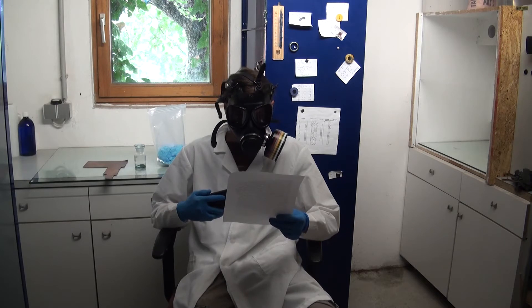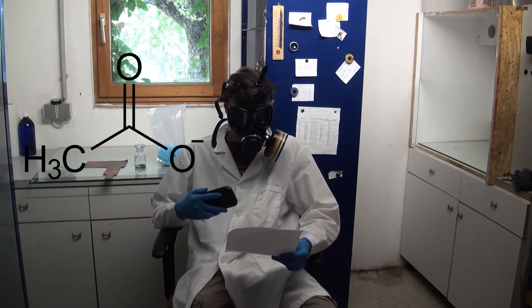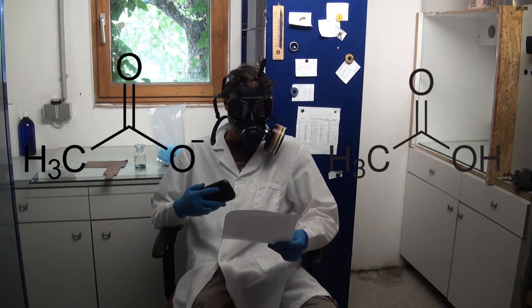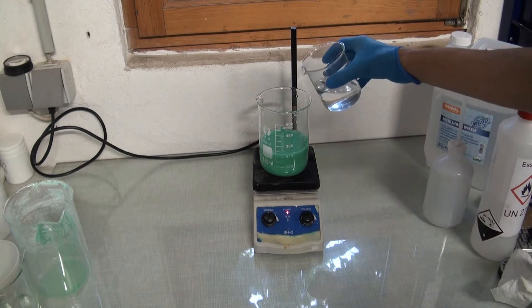Anyway, now that I have the basic copper salt I can react it with an acid to form the salt of that acid. Because I want an acetate I will use acetic acid. The basic carbonate was added into water and then acetic acid was added.